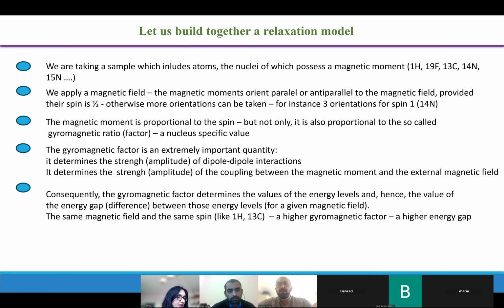Professor, I wanted to ask about the parallel and anti-parallel moments of molecules that we spoke about upon providing a magnetic field. Is it important to have both at the same time, and if so, what is their significance? Does the difference between the parallel and anti-parallel moments provide magnetization? I didn't get it. What do you mean at the same time?